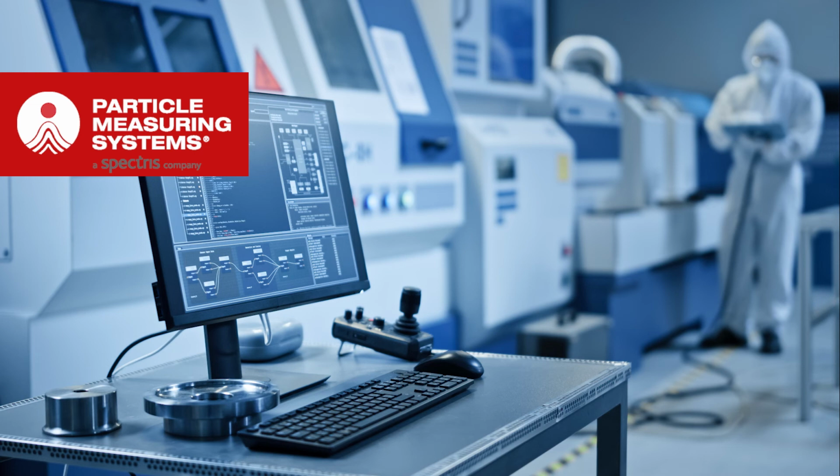So it's trying to use the data to demonstrate to the operators as well as to management and to the regulators that the environment in which your process was made is under good control, not just control. It's giving a genuine reflection of what's actually occurring in the room, not false positives and extra points that don't have any genuine meaning or add meaningful data to what's going on in the room.